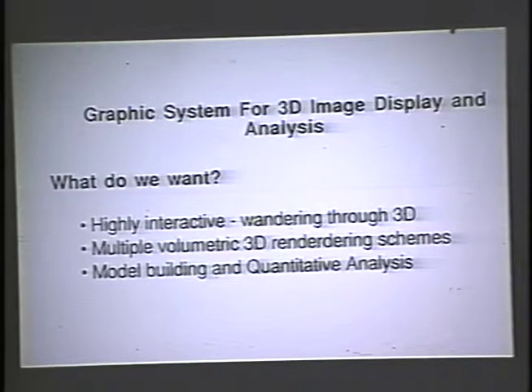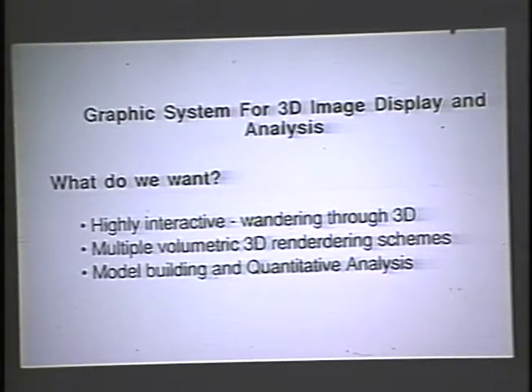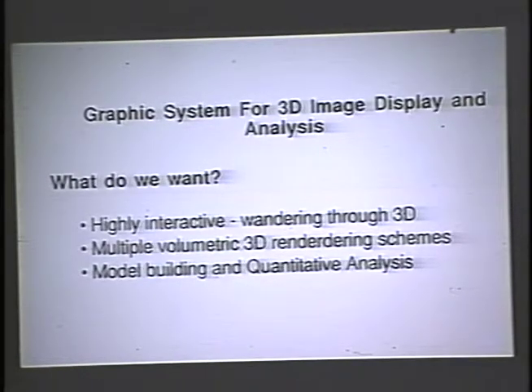Now, the last aspect of this, and I just want to go through this part briefly, and then I'll tell you a little bit about some of the data that we have, and then end by showing you a movie of the reconstruction. Now, the hardest part is when you have 150 million numerical values to look at from a reconstruction to decide what it means. What you have is effectively a big cube of data that corresponds to the electron density, or the electron scattering interactions, of every point of volume within your specimen, and you have to interpret that in some way to understand what the underlying biology is.